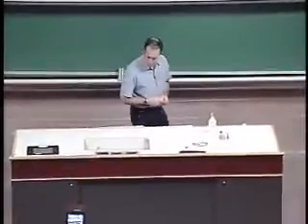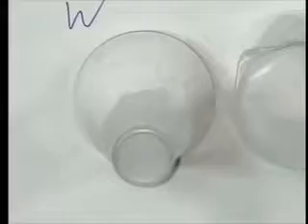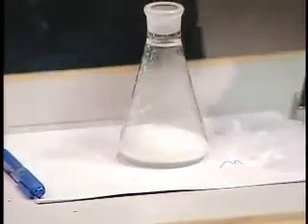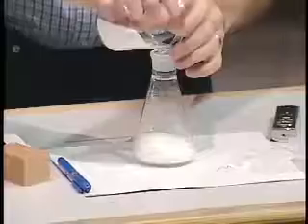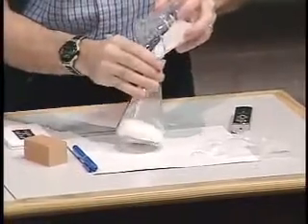I brought some barium hydroxide octahydrate and some ammonium nitrate, and I'm going to combine them. So that must be the barium, it doesn't smell. Ammonium compounds smell. They're both solids, okay? They're both white solids, powdery. There's the ammonium nitrate and there's the barium hydroxide. And I'm going to mix these two together. Hopefully I can get it all in there without spilling it.